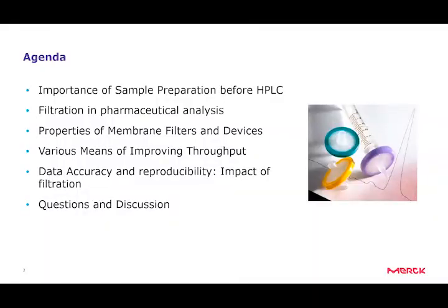In this presentation, I'm going to talk about the importance of sample preparation before HPLC, filtration in pharmaceutical analysis, some of the properties of membrane filters and devices, and various means of improving throughput, data accuracy and reproducibility. And finally, at the end, after Ahmed's presentation, we'll do some questions and answers.